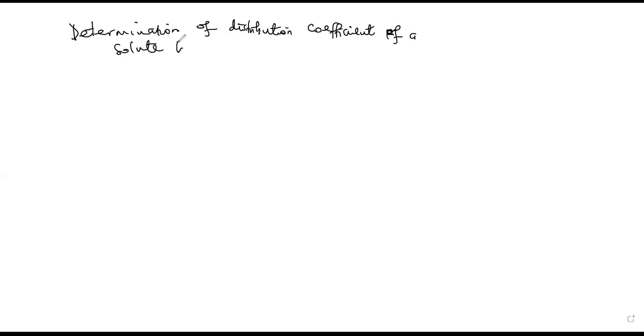We are going to look at the determination of distribution coefficient of a solute between two immiscible solvents in contact.